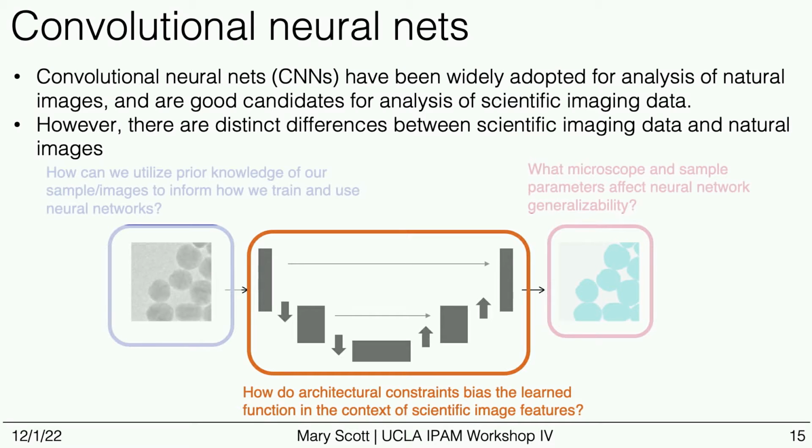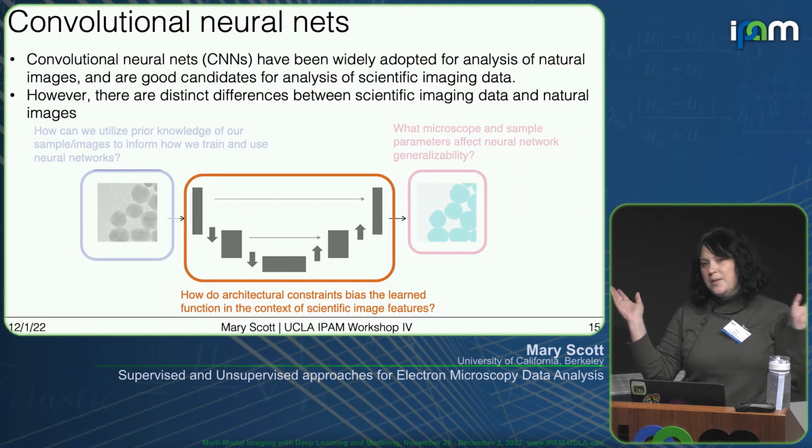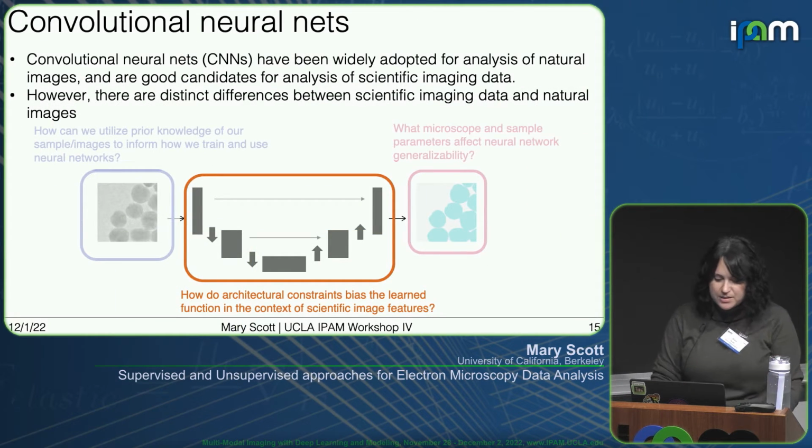In general, the most major architectural constraint that we really can't change is that we need to use lightweight neural nets for this type of analysis. Our data sets will typically be 100 images. The biggest data set that a student in my group has ever labeled was 4,000 images, and I don't think she has forgiven me for that. That's compared to 14 million annotated images for ImageNet. So we are always going to be constrained to a lightweight neural net so that we do not overtrain.